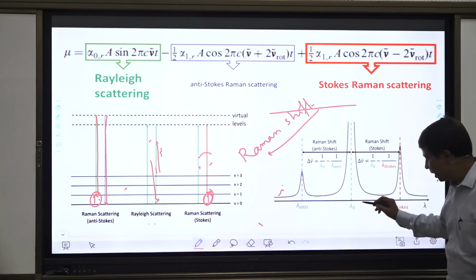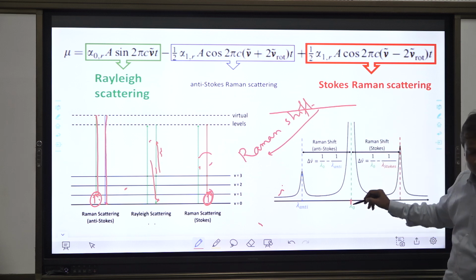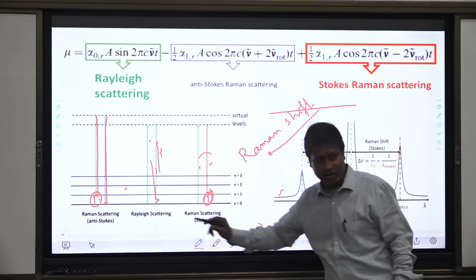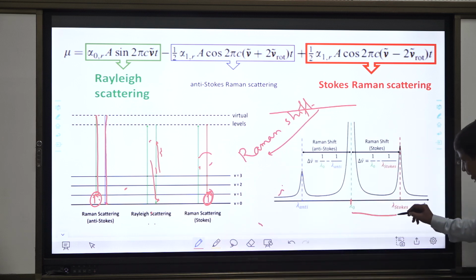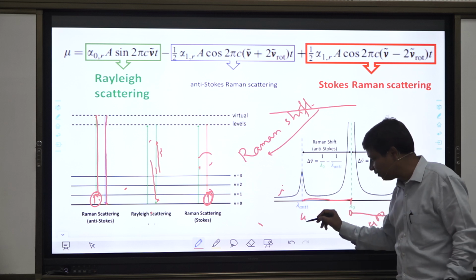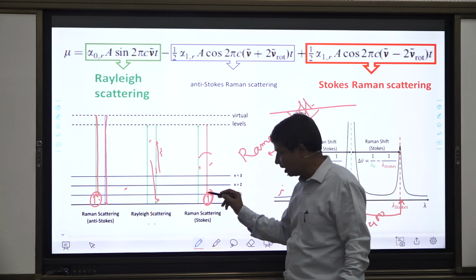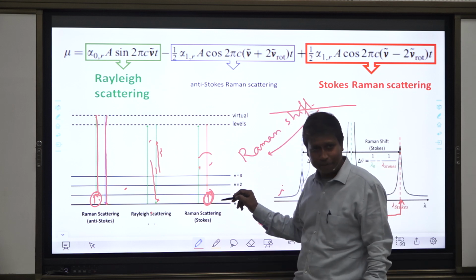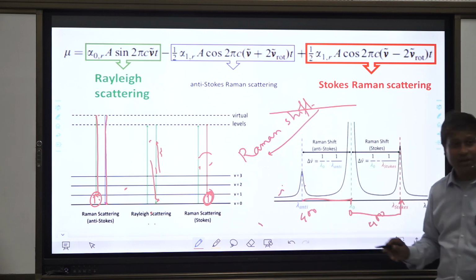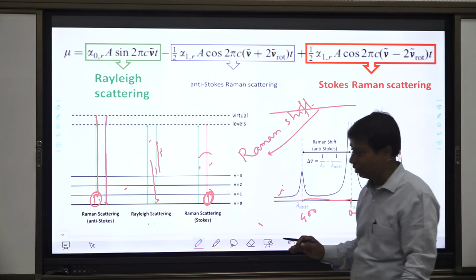That is why in the Raman spectrum, at the center position you see the strong Rayleigh band. From the center, wherever the Stokes shift comes, if it is 400, then in the other direction, exactly at 400, your anti-Stokes bands will come, because both indicate the same difference of the energy level. And these bands are coming because of the difference of energies. It is not directly absorption.